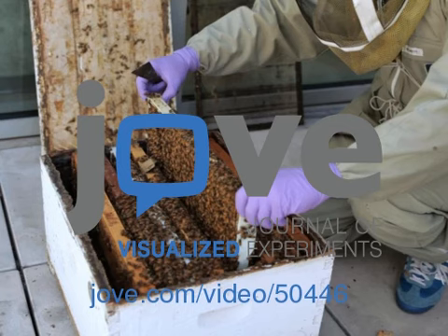PER is a standard method used to measure gustatory perception in honeybees. However, it is very sensitive to handling, so one must be very careful when keeping consistencies between the environment and handling of the animals. In addition, if the assay is going to be performed over several days, it's a good idea to keep a short timeline and keep an eye to make sure the weather and the environment doesn't change.